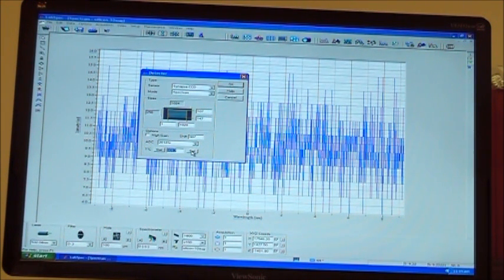But once you bring the system up from off, you would have to open this detector window, and again come in here in the temperature and type in minus 70, and then hit set. Okay. And then the detector will stop at minus 69. It doesn't actually stop at minus 70. Once it hits minus 69, the detector is safe to use. The detector actually is good to use even if it stops at, like, once you're at minus 55, the detector is pretty stable. But you don't want to use it until the temperature stops moving.